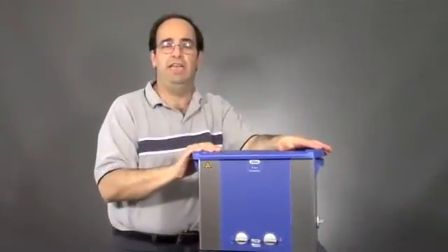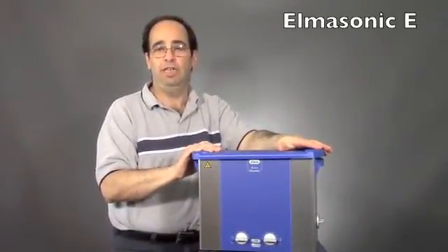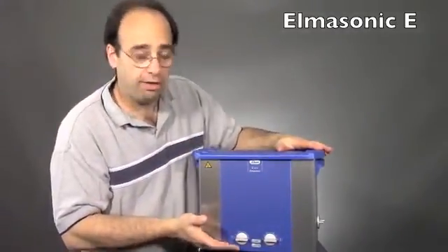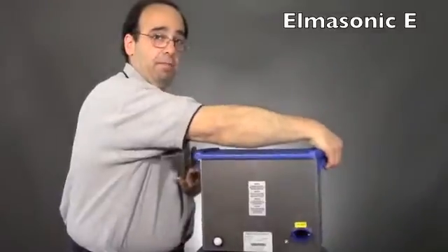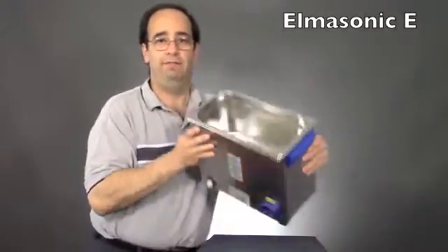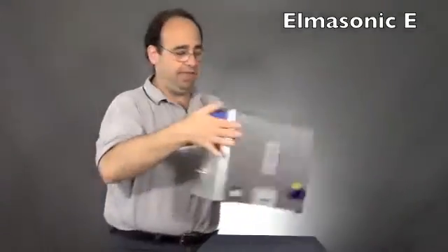Let's start with the Elma Sonic E line, your basic unit. It works for almost every application. You've got dials on the front, a drain on the back, the lid, and of course the stainless steel tank on the inside.